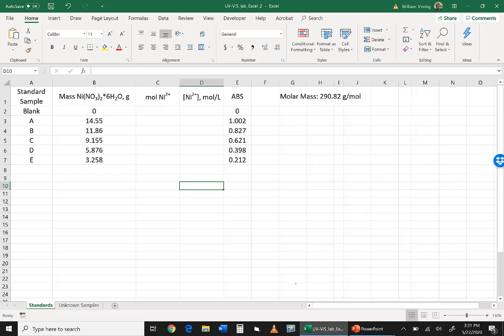So what we have here is we have the data already added. So we have our blank and our five solutions, A through E, for our standards, and the mass of nickel 2 nitrate hexahydrate in grams, and we have our absorbance measurements. Those are the things we've measured already.